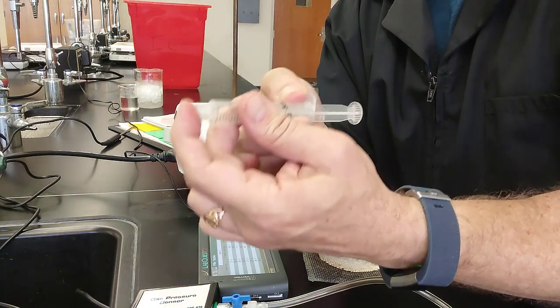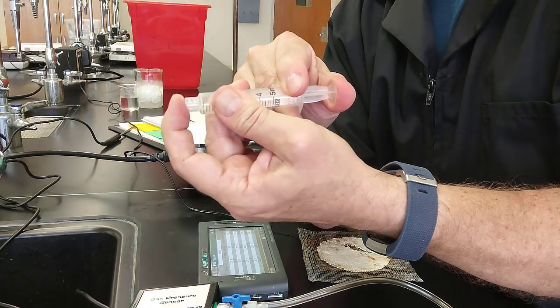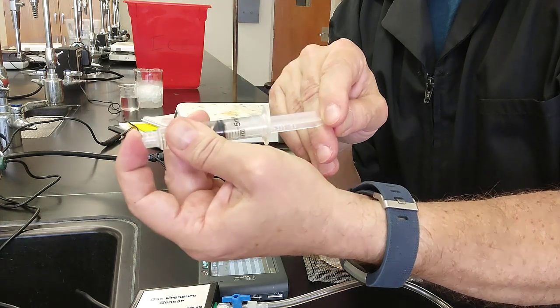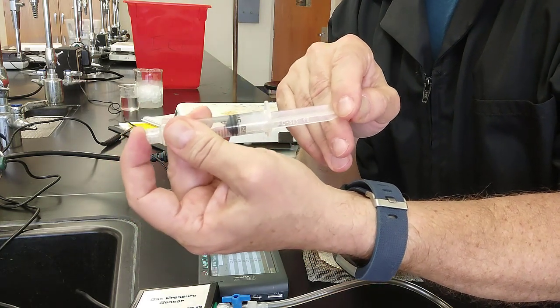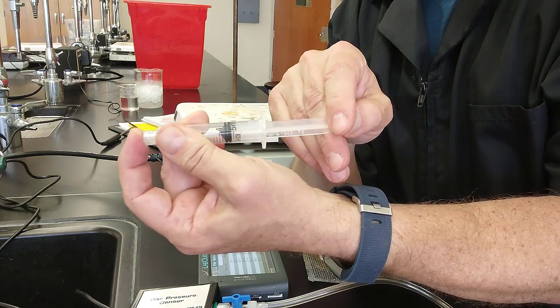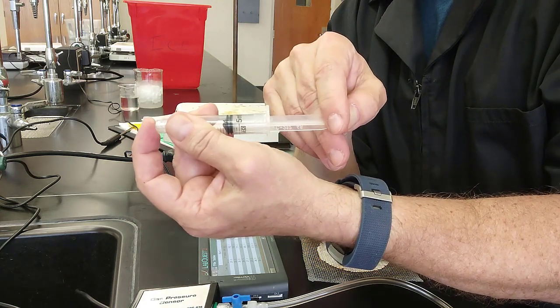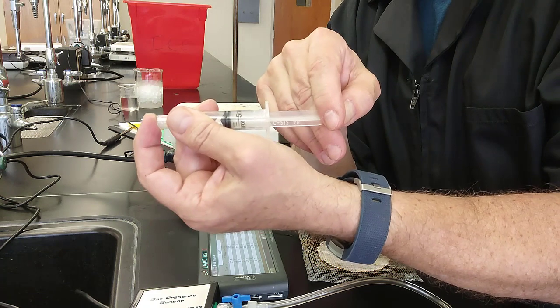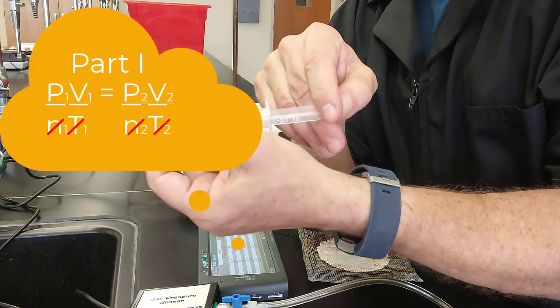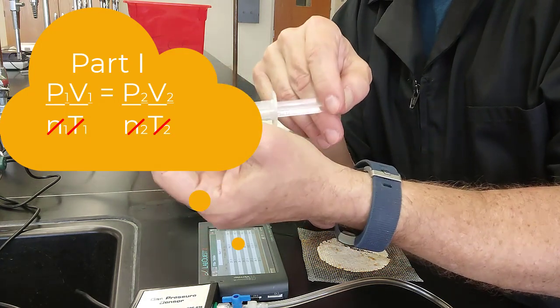The syringe was attached to the gas pressure sensor, and so when we squished the gas, we were literally squishing the gas. We weren't changing the amount of gas in there. And when we expanded the gas, we were literally providing more volume for the gas to be in. We weren't changing the amount of gas, because this was, again, hooked up to the gas pressure sensor. So we didn't change the temperature in part 1, and we didn't change the number of moles in part 1. They were constant. So PV over NT equals PV over NT. We didn't change N and T. So it was just PV equals PV.